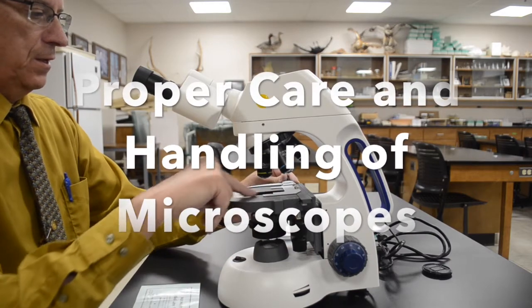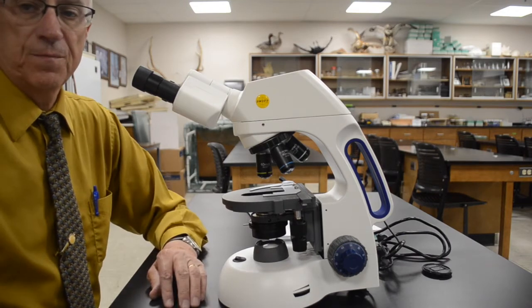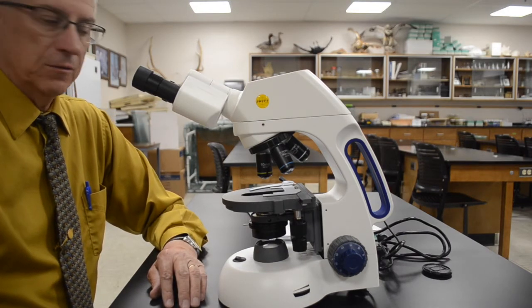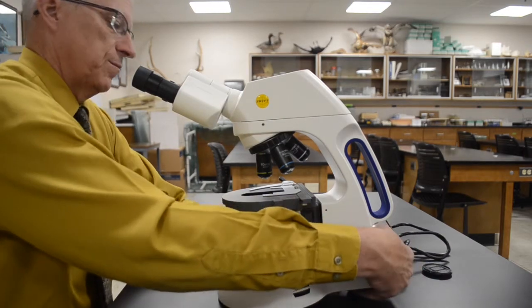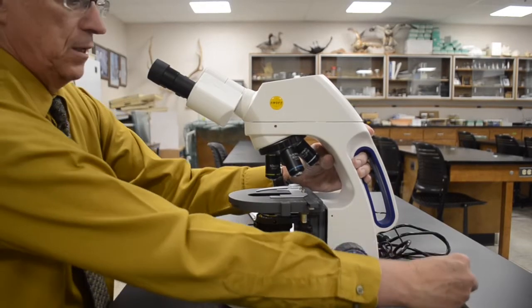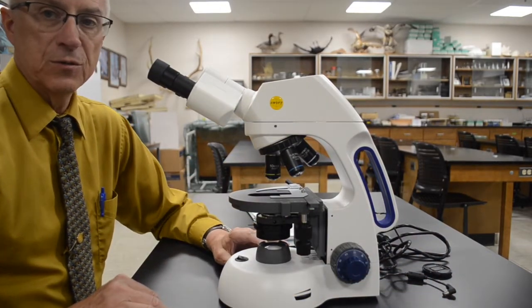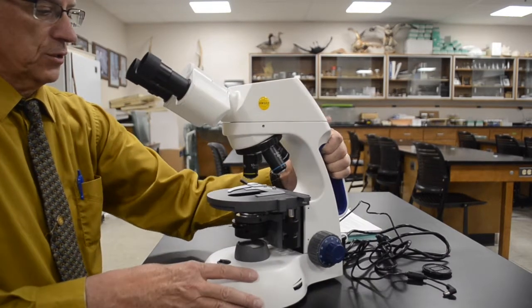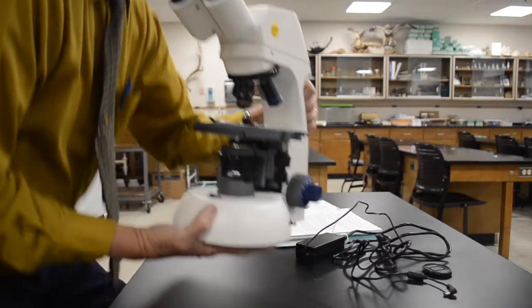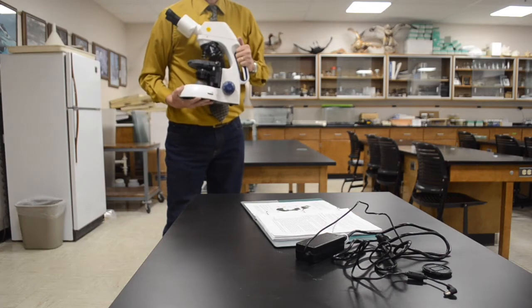First of all, let me show you how to carry a microscope. This is probably going to sound insulting, but it's really important that you learn this practice. Every time you carry a microscope, you should always use two hands. One hand should go on the arm, and the other hand under the base. And when you carry it, you should hold it up next to your body like this.